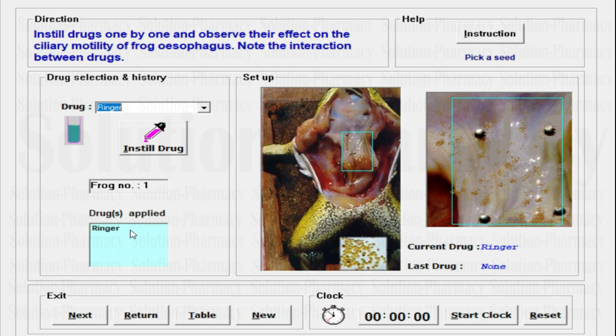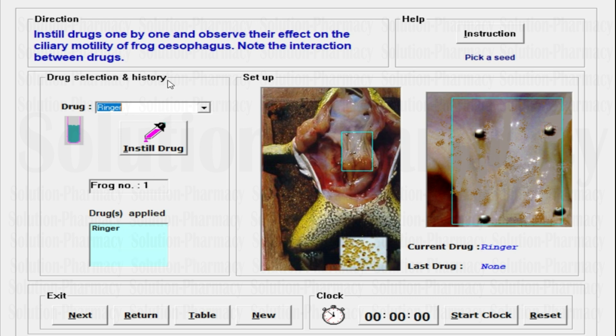This is the history tab. We have selected Ringer, so Ringer is listed by default for the first time. After you select another drug, those drugs will be listed inside this history. So this was the Drug Selection and History tab.